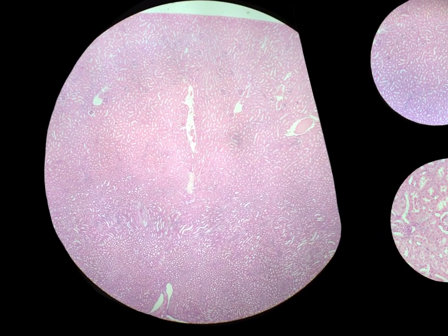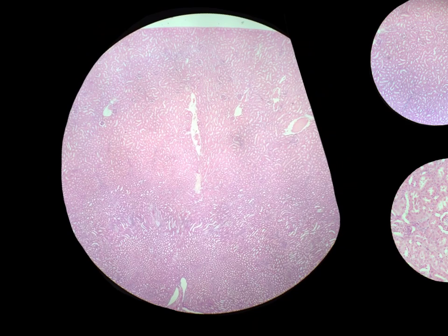Okay, we're going to just do a basic introduction to the kidney. We've got 3 slides here of progressively more magnified views, so we're going to get these real close-up ones out of the way for a second. We'll start with just the general kidney tissue here. And so overall, we don't have a very high resolution, but that's okay. That's not really what we're looking at here.